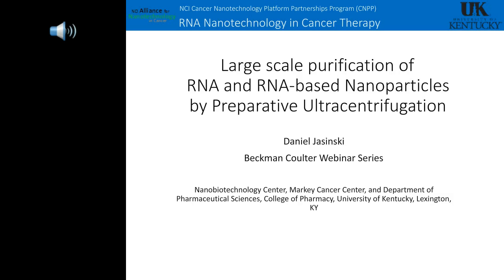Just a few more moments. It looks like 43% have never purified RNA, 28% use organic extraction, 17.9% use electrophoresis, 7% chromatography, and 3% ultracentrifugation. So we can definitely present our results of ultracentrifugation here and hopefully skew you in that direction.